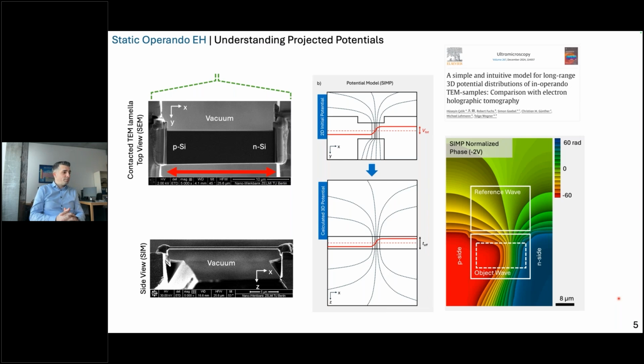And this is actually a big problem for electron holography. You always have to keep in mind what your reference wave is doing. In theory, it is always assumed that the reference wave will be unmodulated, but in reality, we are facing a lot of stray fields due to our specimen. And so it is always the difference between reference wave and object wave we are measuring in the experiment, due to the superposition of two electron waves.